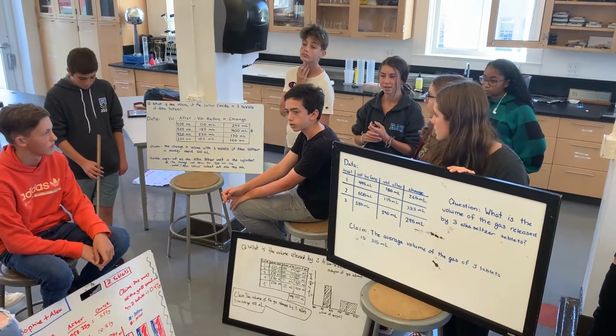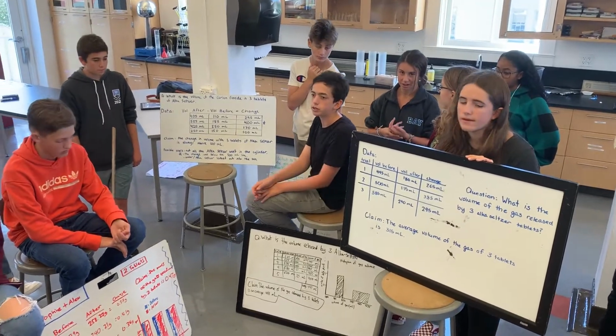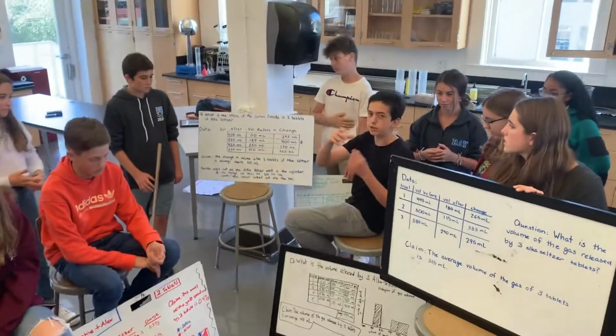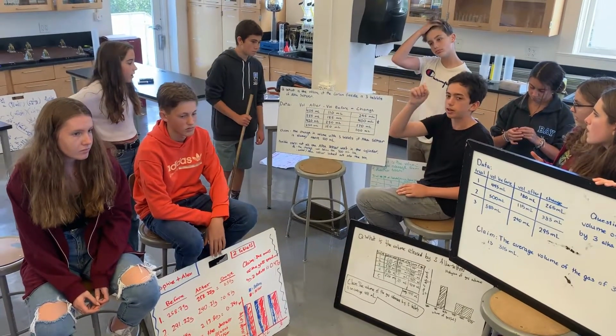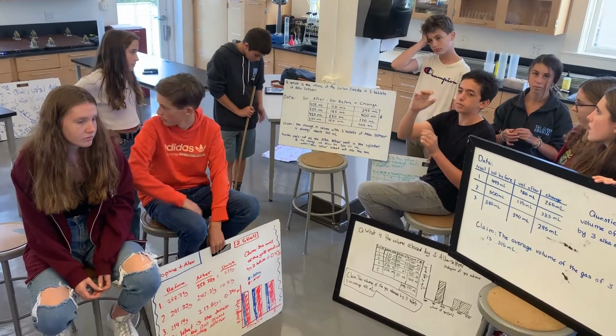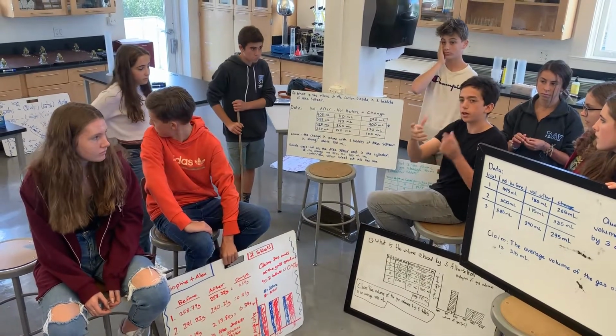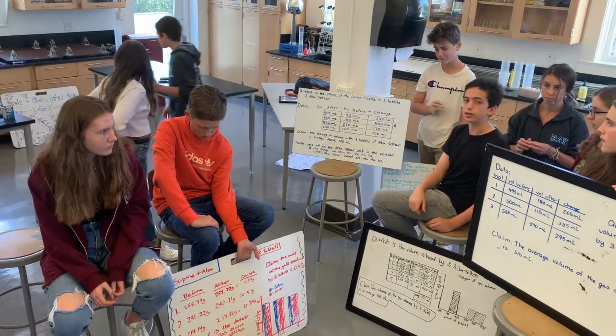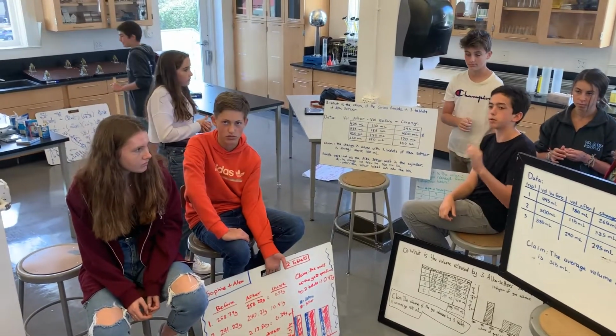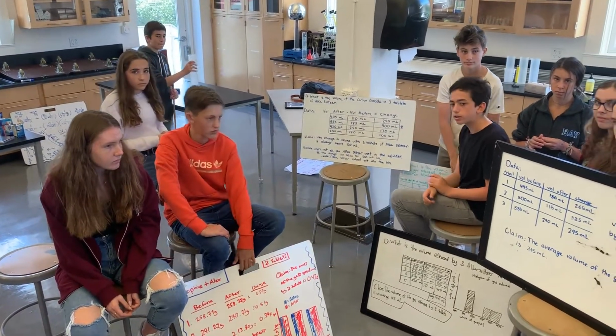We also probably messed up because we had to guess parts of the graduated cylinder that weren't already measured out. The markings stopped at 500 milliliters, and there's some space at the top. The markings don't go all the way to the top, so you have to estimate where the markings would be in that area.